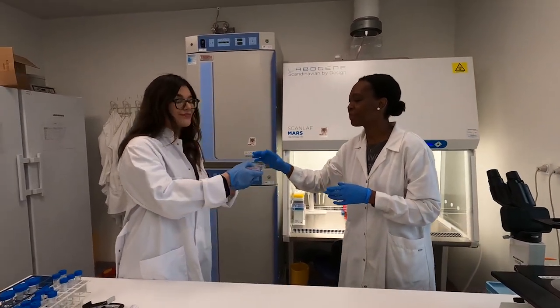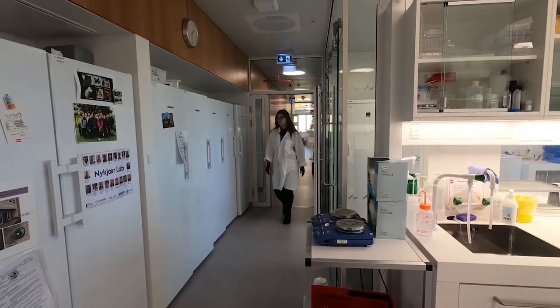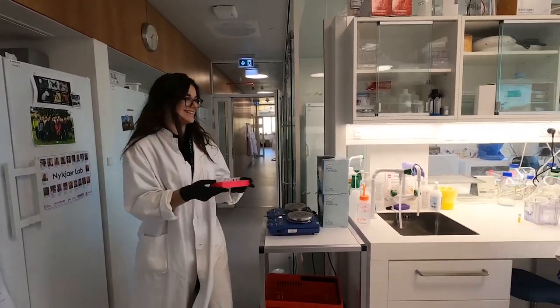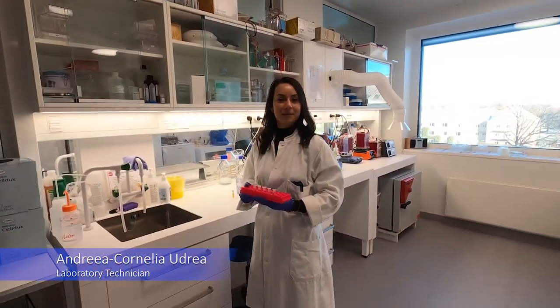Sure, no problem. I'll ask our lab technician, Andreea, to help me with that. Hi, Andreea. Hi, Pia. Could you help me with a Western blot today? Of course. My name is Andreea, I'm a lab technician, and today I'm going to show you how to load the gel.